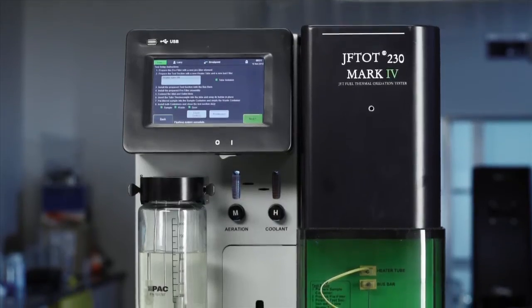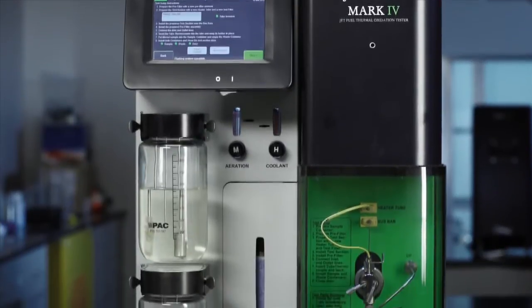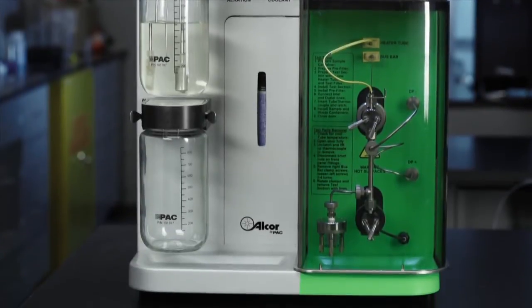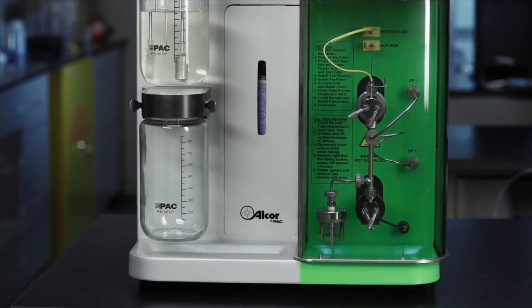In the past, Jet Fuel Analysis was a time-consuming process that required the user to manually perform several key steps. The Jephtot 4 automates many of these steps, making it easy to use.